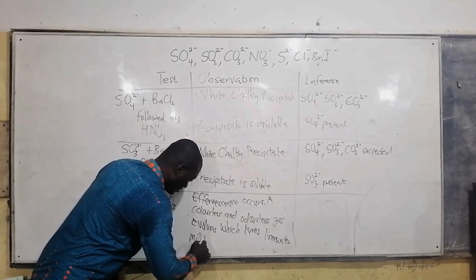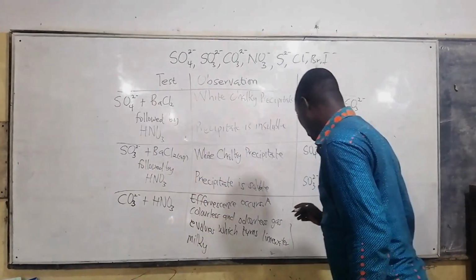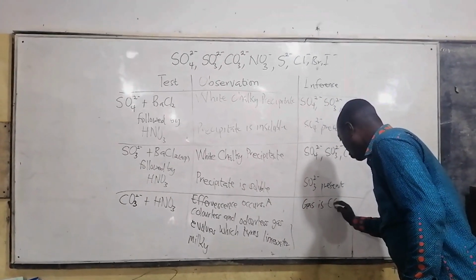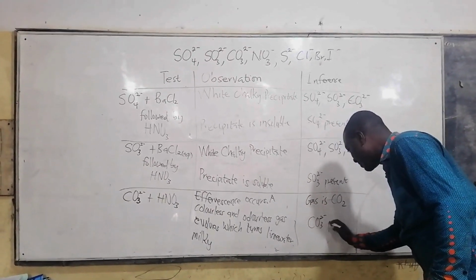Obviously, this is carbon dioxide gas. So we conclude safely that the gas is CO2, therefore CO3 2 minus is present.